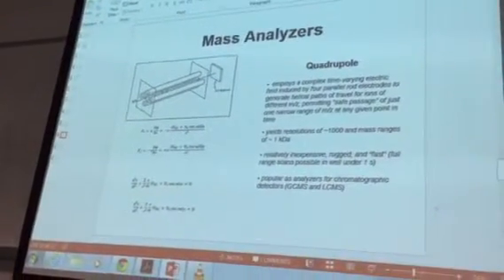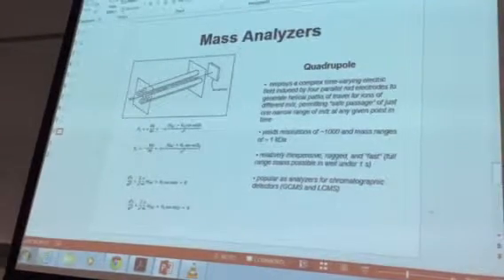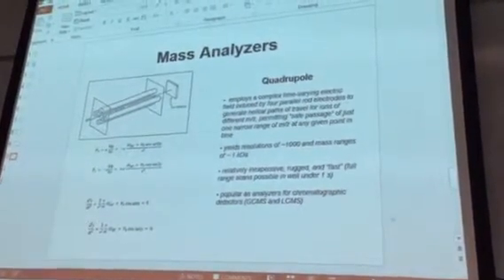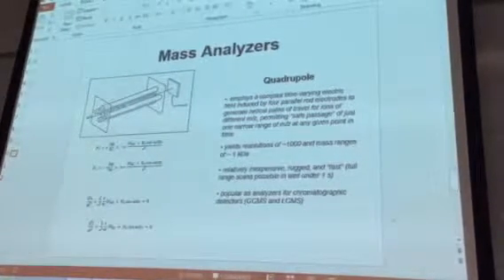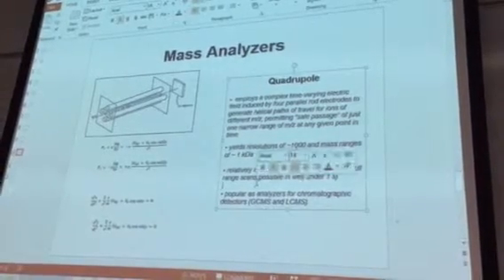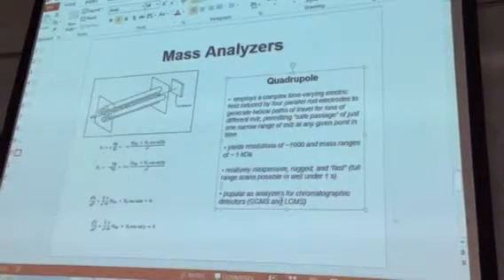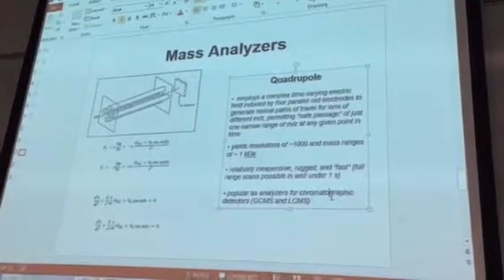We also have 2 mass spectrometers with different ion sources, electrospray, and then a nifty one we're not even talking about here, but we'll chat about in lab later in the semester, atmospheric pressure chemical ionization. But they are, what's the word, solids and liquids are amenable to analysis here, non-volatile compounds, right? The quadrupoles, real popular as mass analyzers for chromatography coupled instruments, hybrid instruments, GC mass spec, LC mass spec, etc.